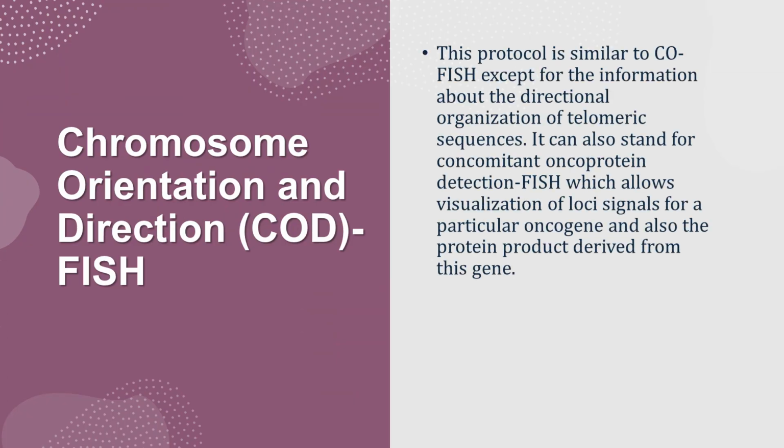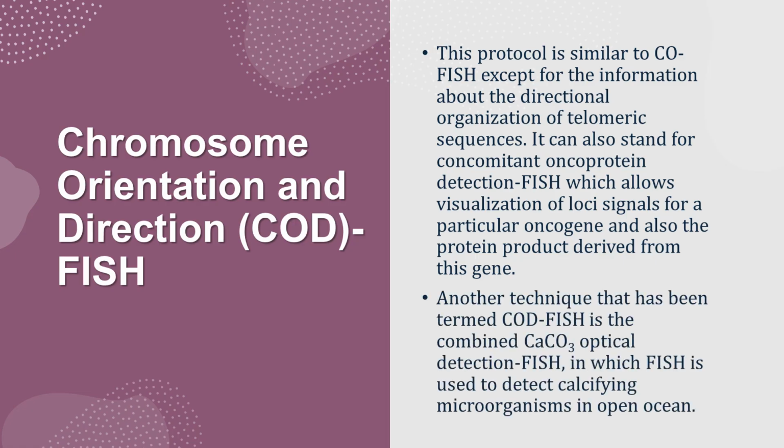Chromosome orientation and direction, COD-FISH. This protocol is similar to CO-FISH, except for the information about the directional organization of telomeric sequences. COD-FISH can also stand for concomitant oncoprotein detection FISH, which allows visualization of loci signals for a particular oncogene and also the protein product derived from this gene. Another technique that has been termed COD-FISH is the combined CaCO3 optical detection FISH, in which FISH is used to detect calcifying microorganisms in the open ocean.